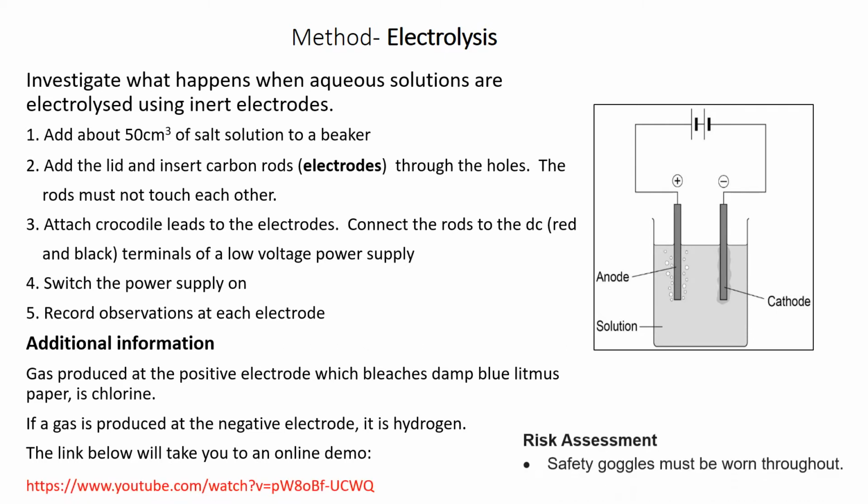So, risk assessment. Safety goggles need to be worn throughout. There is a risk of electrocution.